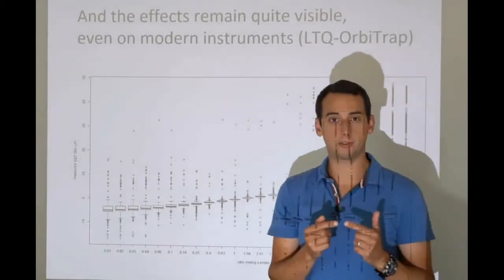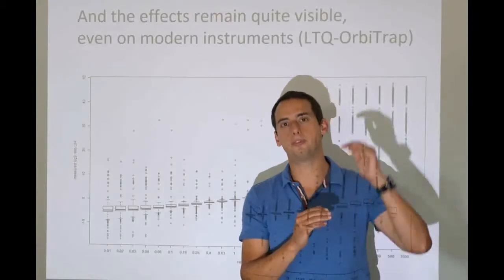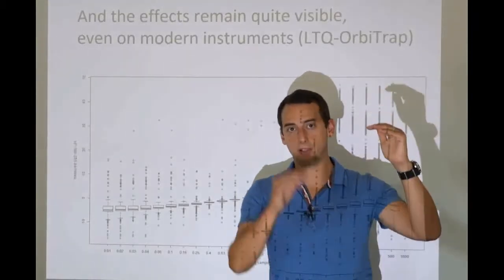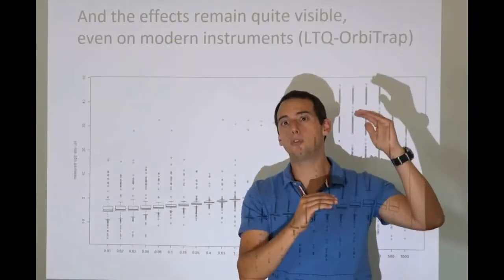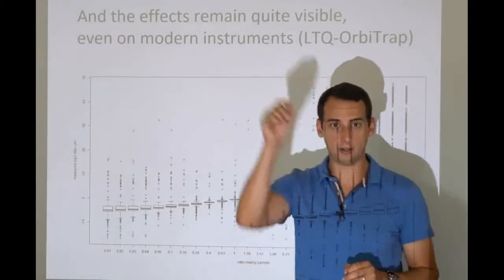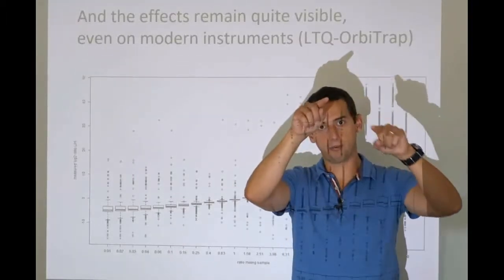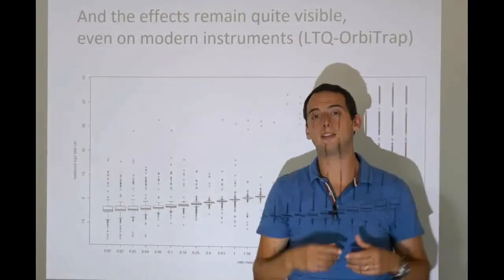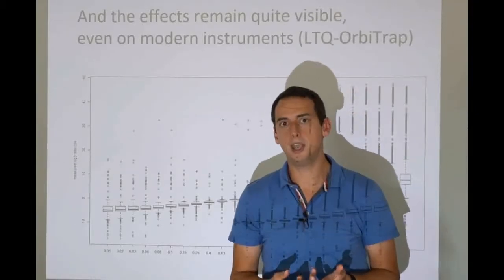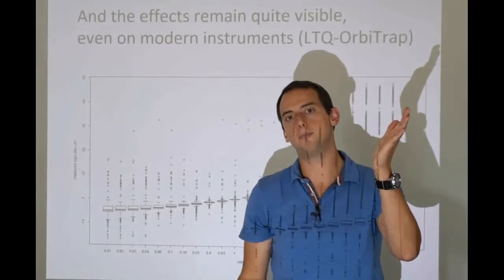So when you use a detector over time, the sensitivity of that detector, which is the amount of signal it gives out depending on the amount of signal coming in, will start to go down. If I put in exactly the same amount of ions on the top of the detector, over time the signal the detector will give will start to go down. So the detector is losing its capability of ejecting enough stuff every time something hits the plate.